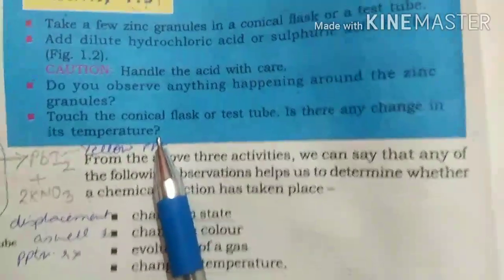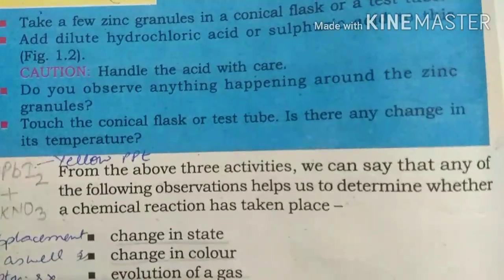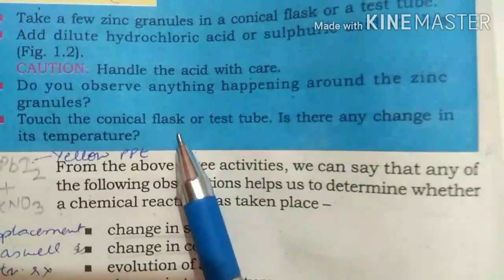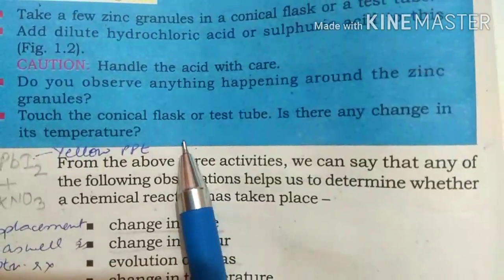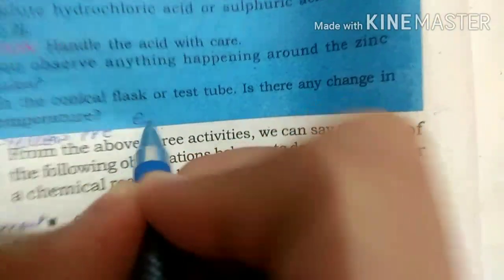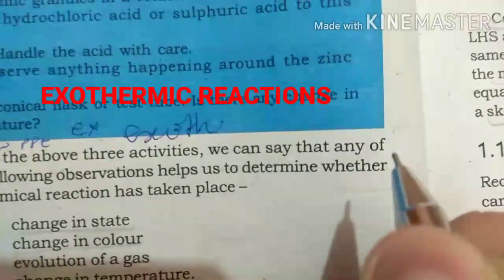Yes, the temperature will increase and the conical flask will be warmer to touch. Okay, so such reactions in which heat is produced are called as exothermic reactions.